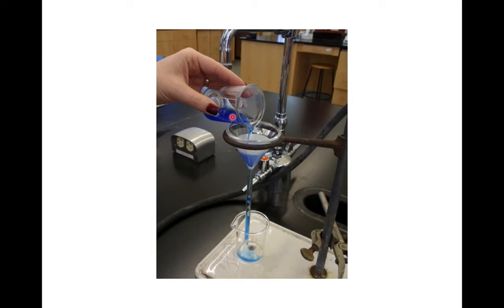Here's an example. We've added just a bit of blue dye to this so that it's more prominent, so more easy to see. You are pouring it in and just going to let it drip through.